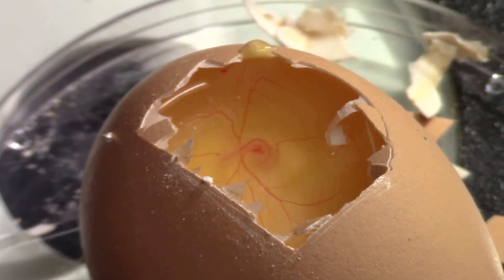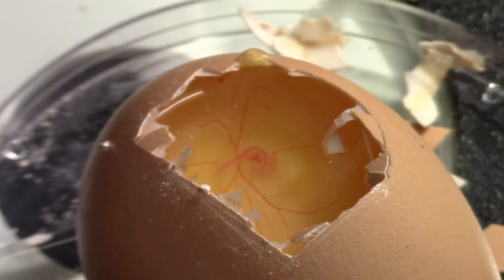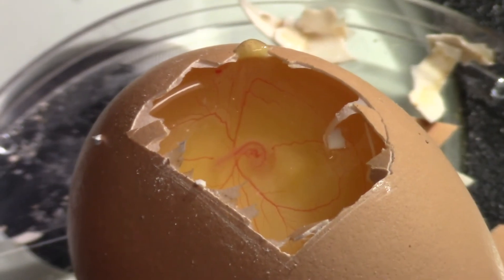We're going to try to show you this under a higher magnification through the microscope. The beating heart is visible. You can even see the different compartments of the heart. At the bottom of this picture would be where the brain is. The right of this picture would also be brain wrapping around the internal organs. And then off to the left, that purple line that bends like a question mark to the left, would be the body of the embryo. You can see the two blood vessels going off, one to the top and one to the bottom. Those feed the embryo from the yolk.